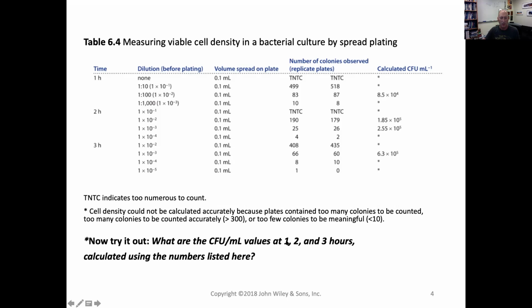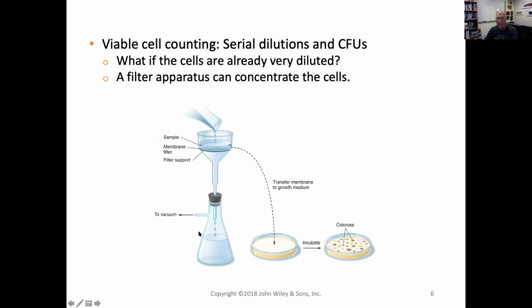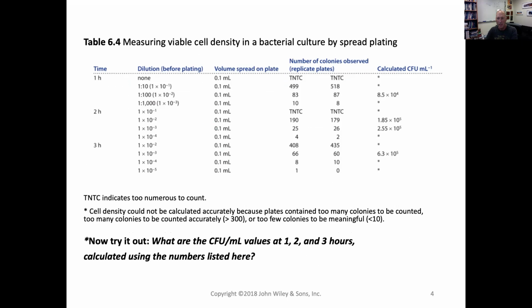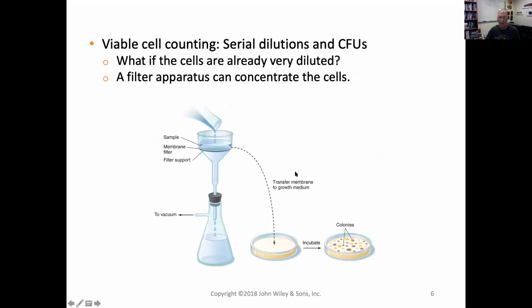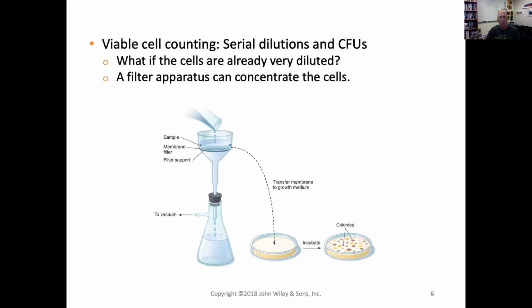That's actually all shown there already. But again, you're going to be doing this in your worksheet, okay? Oh, I just realized it didn't, yeah. Anyway, all the numbers. So I just asked you to calculate it, but the numbers are already shown there, okay? So make sure that you can do that calculation of CFU per mil correctly, right?